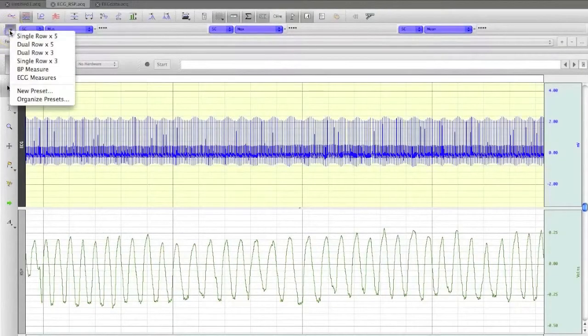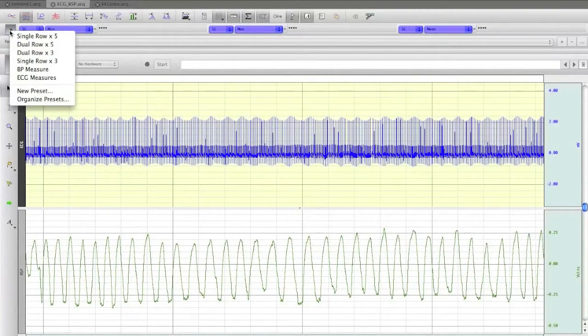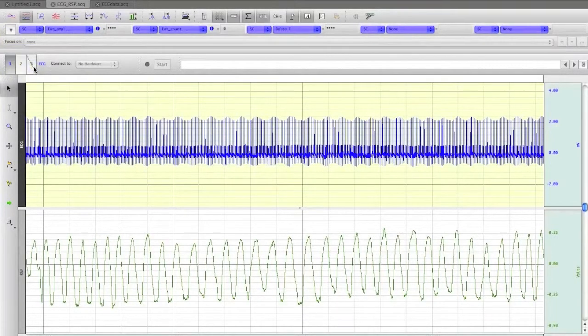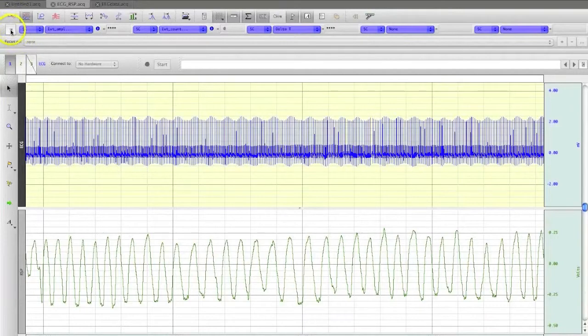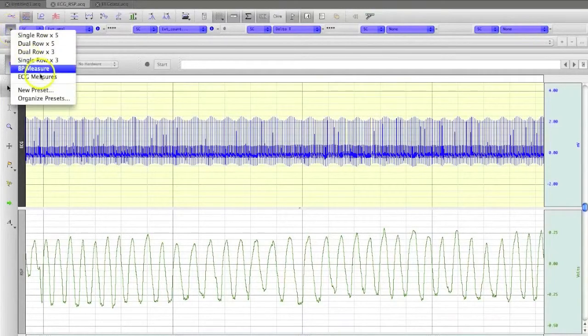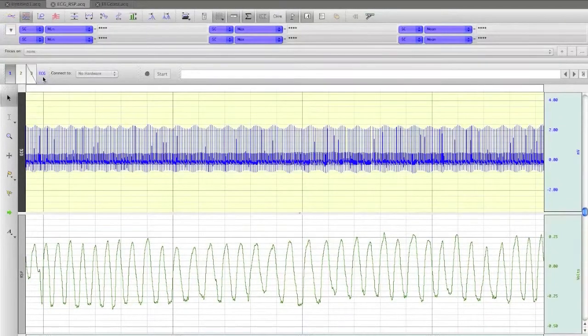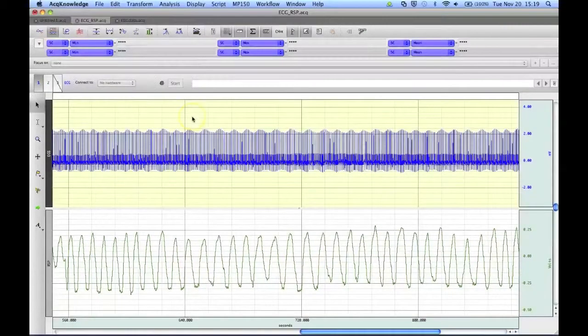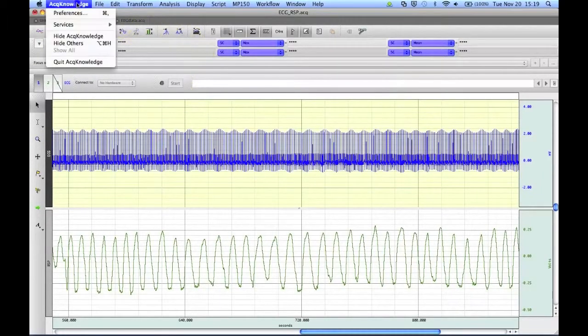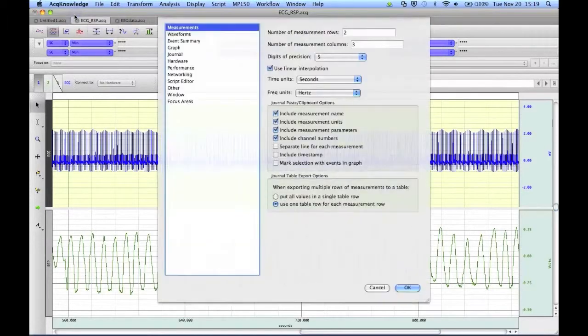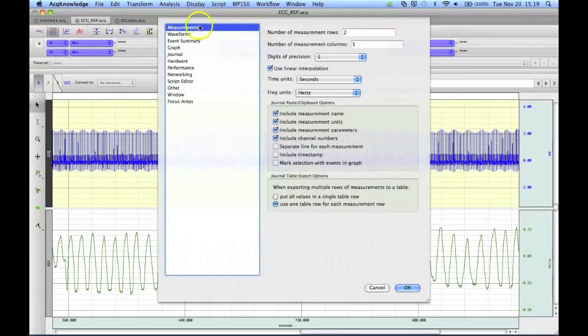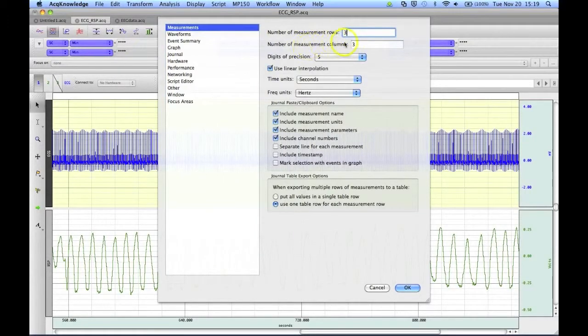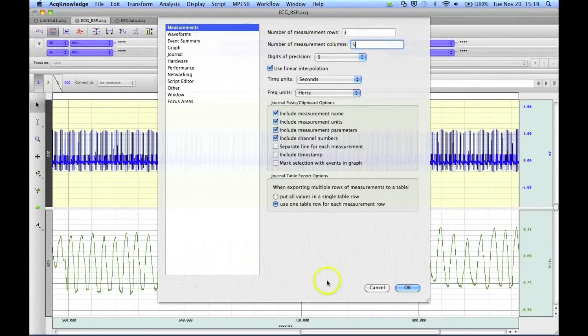You can also tailor them to your signal of interest, such as a preset for blood pressure measurement, a preset for ECG measurement. To create your own measurement preset, you can go up into the Preferences menu, and under the Measurements option, you can select your number of rows and your number of columns, and then click on OK.